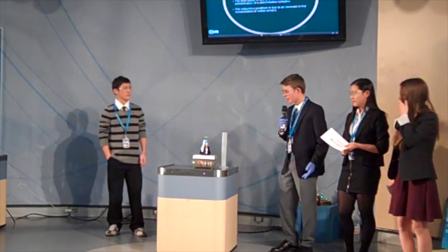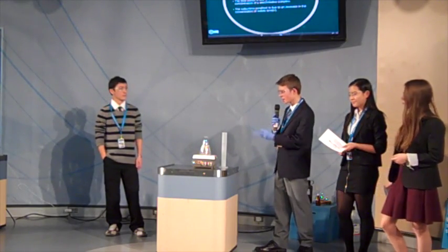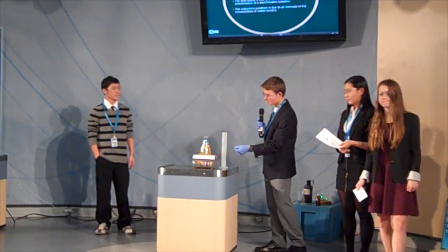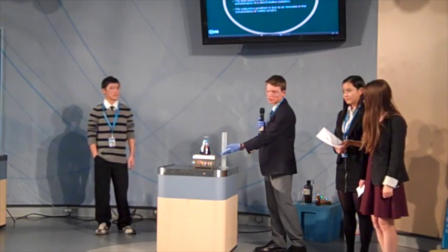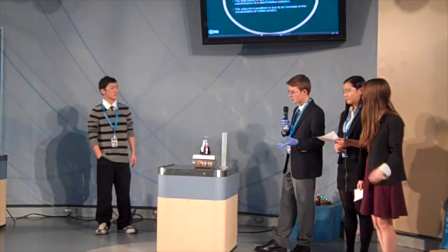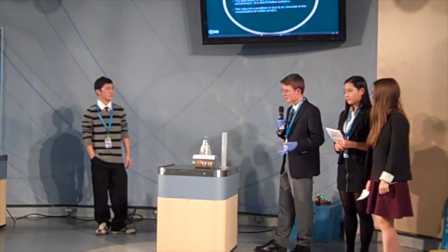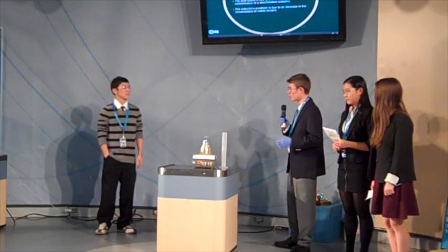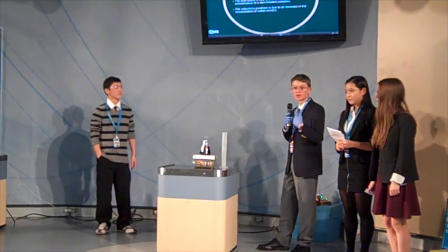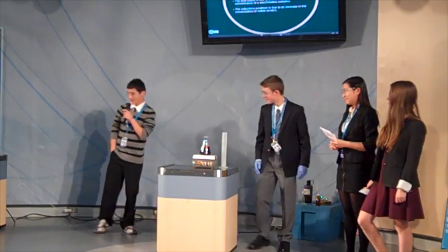So the yellow color is produced when iodide ions are interacting with the hypoiodous acid here, and it forms the iodine. But as you can see, it is quickly engulfed by the reaction, which results in the color blue. Although it's clear that the components of this reaction are many, and the reaction is still quite unknown to us, it still is a brilliant example of a reaction that occurs in two ways. It doesn't just go once and stop, but it's an oscillating reaction, meaning it occurs again and again, and it's pretty fun to watch too. Alright, thanks.